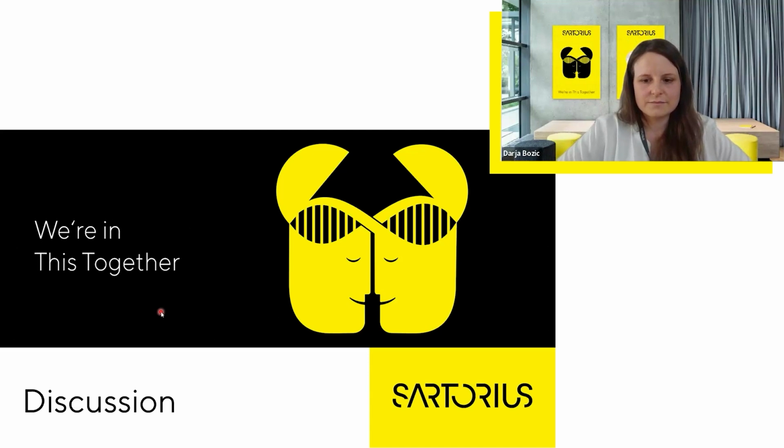Somebody has asked for some more information related to plant-derived exosomes. For plant-derived samples, yeah, actually we have in the past analyzed some of those. The plant-derived vesicles are kind of particular because there are not many specific probes available, but we already obtained some profiles using some membrane dyes. So yeah, it can be applied.